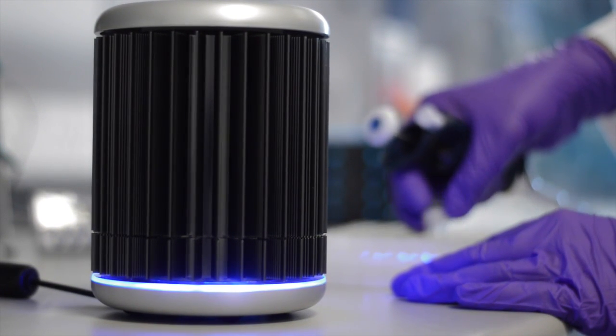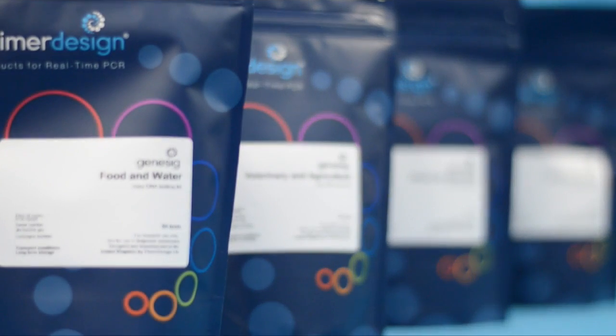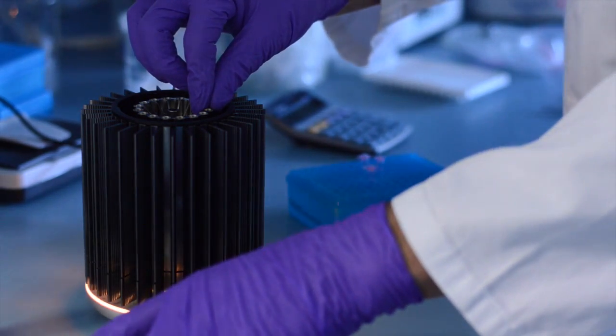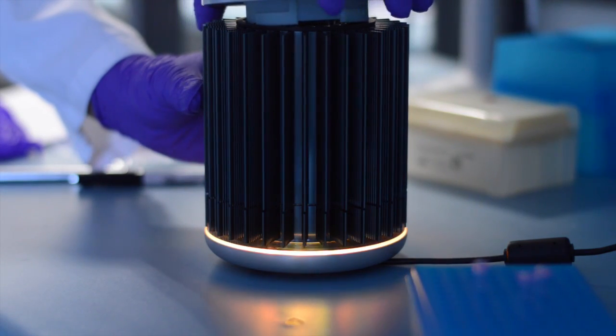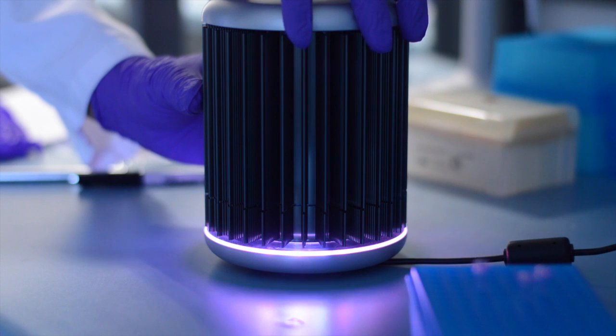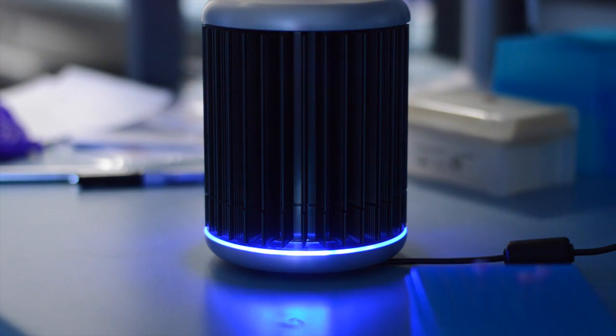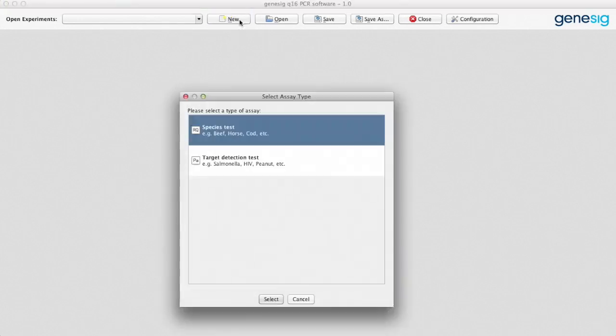There are close to 400 different tests available for the GeneSig Q16 and they're all incredibly easy to use. The protocol is virtually identical for all the different tests. Let's start with a look at the software that drives the Q16. It's incredibly simple to use.